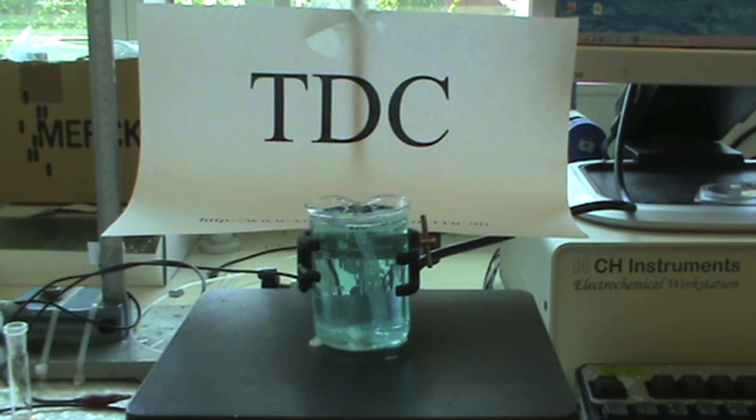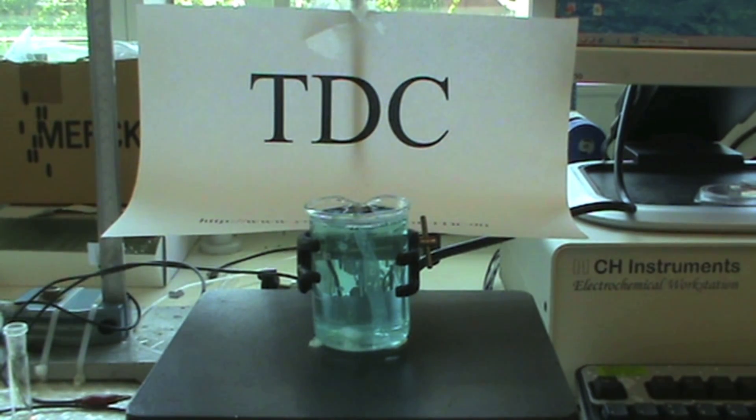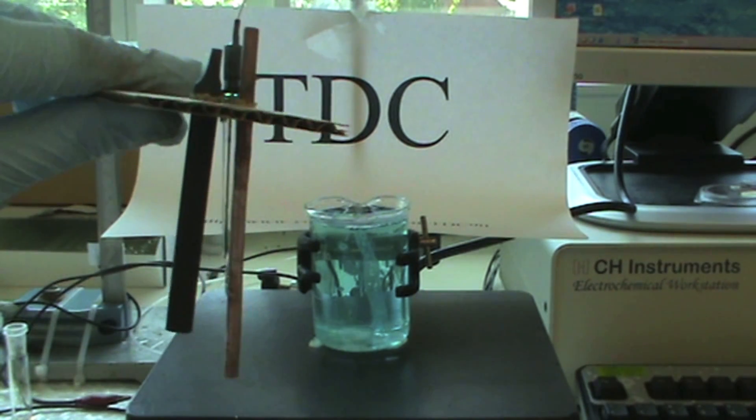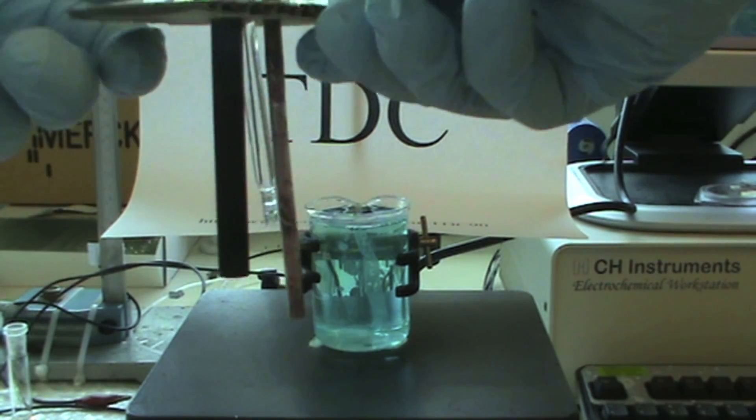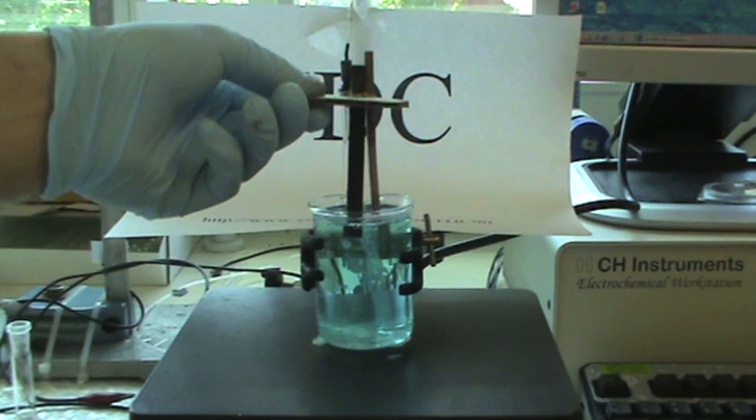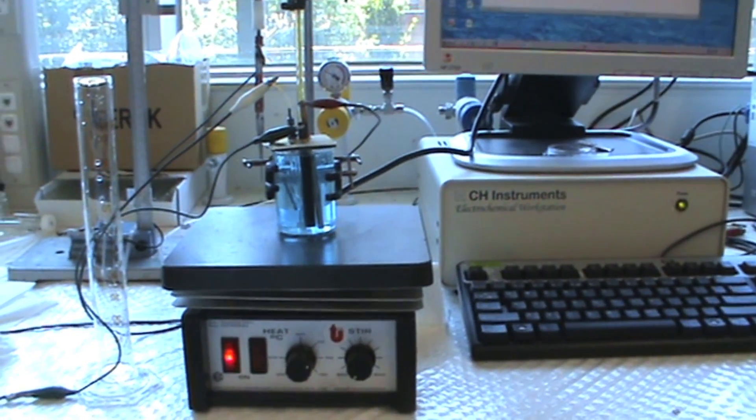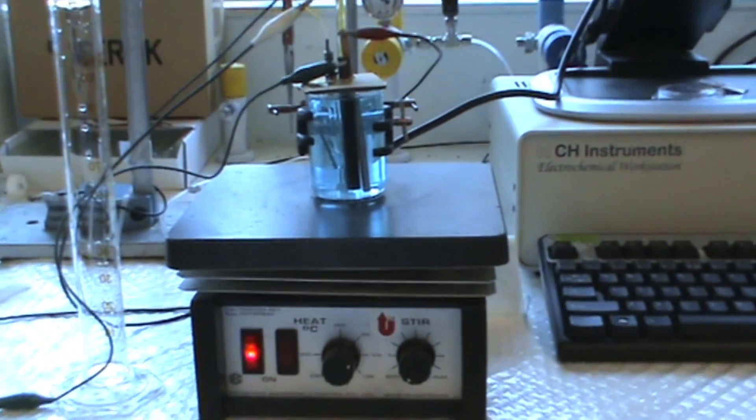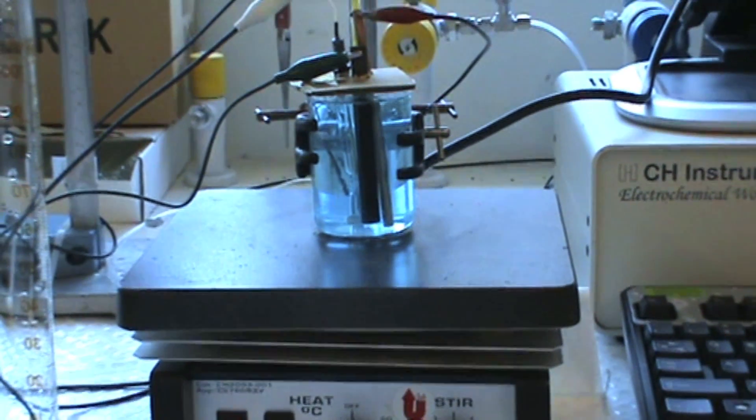After that, we connect the usual electrodes in place to the electrochemical potentiostat, along with the electrodeposition parameters, just like in the previous videos. Keeping the temperature of the bath constant at 60 degrees Celsius, start the electrodeposition.